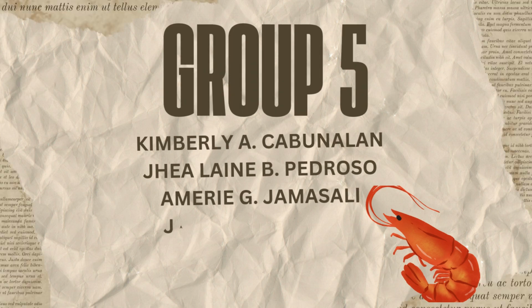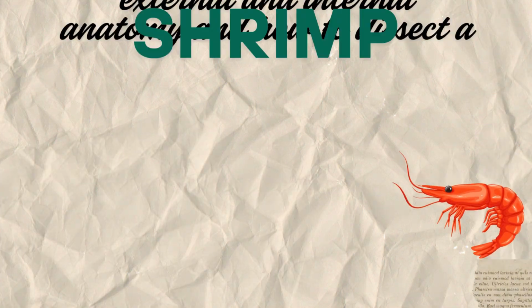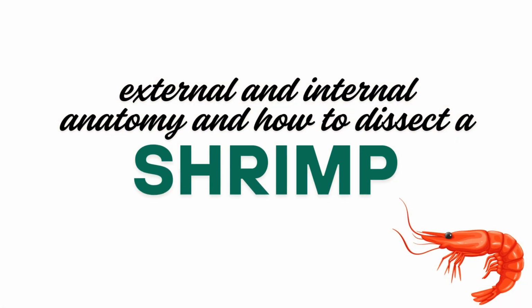We are Group 5 and today we will identify the external and internal anatomy of shrimp and also demonstrate how to dissect a shrimp.